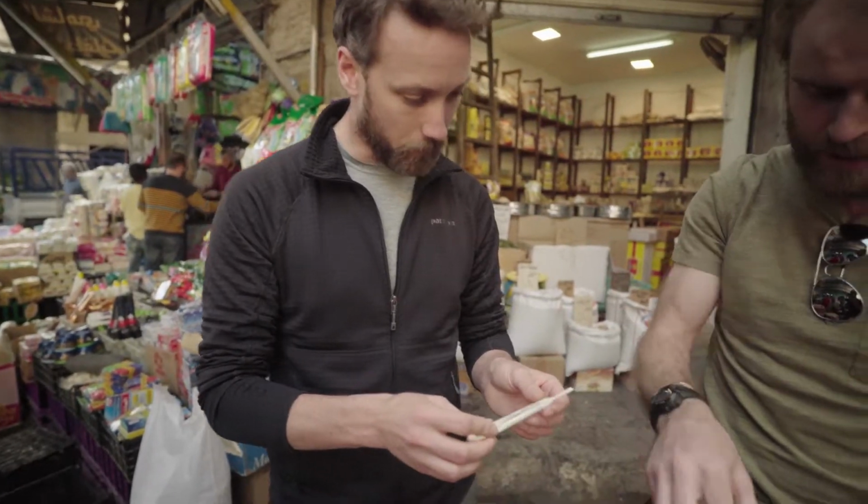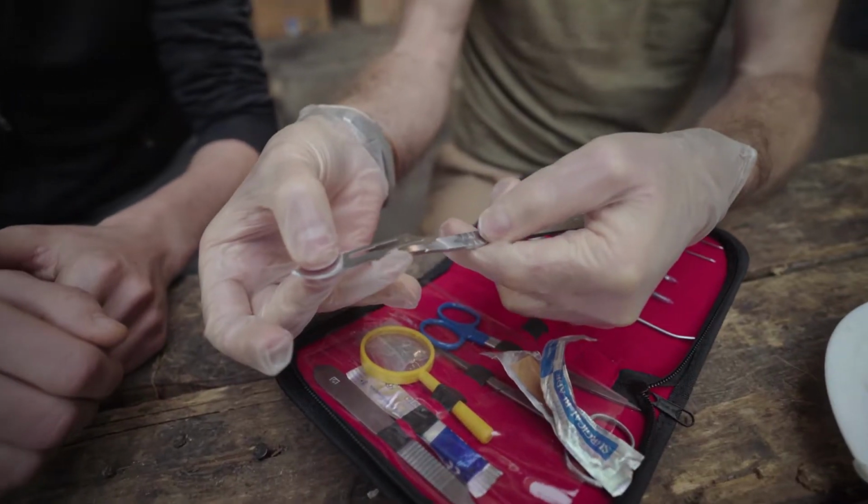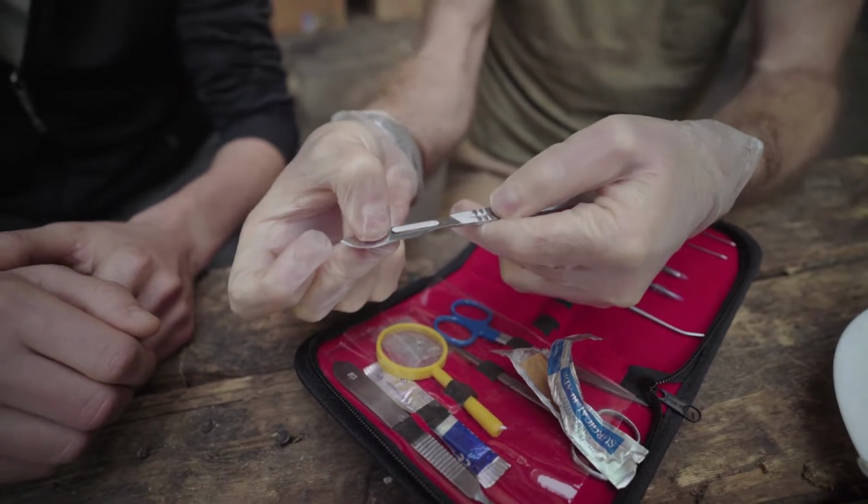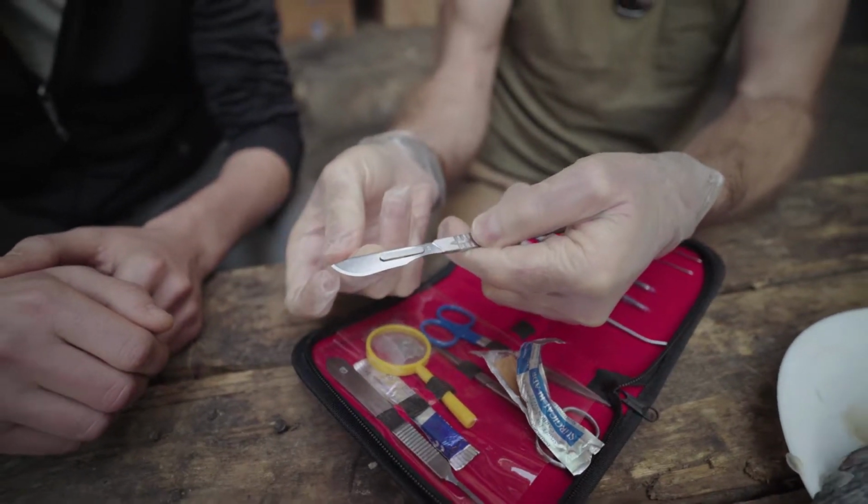And then most importantly, for any anatomist, is this. So that's our bare scalpel handle. It doesn't become a scalpel until we put a scalpel blade on it. A surgical blade. Carbon steel, very, very hard, and as a result, very sharp.